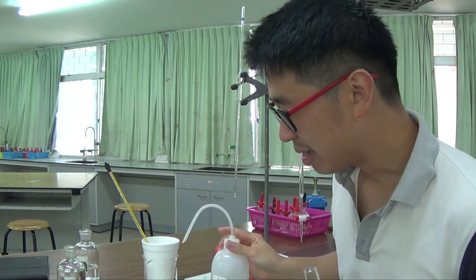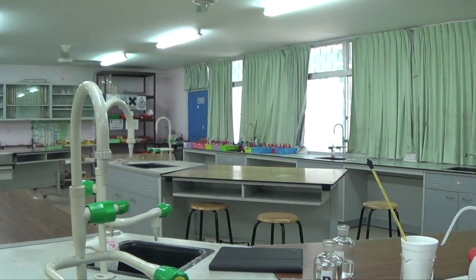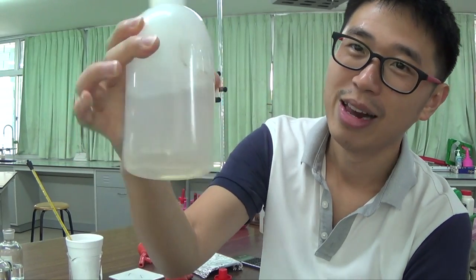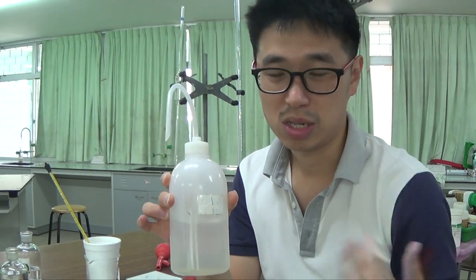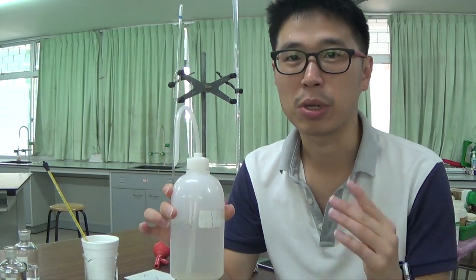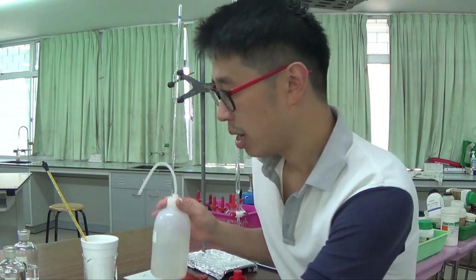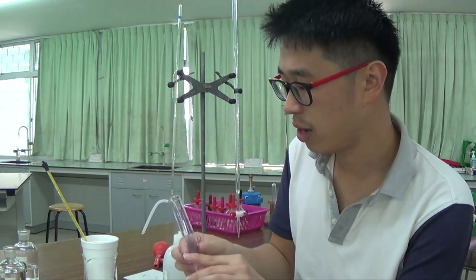They say add water, but what you never do is use tap water. What we use instead is distilled water or deionized water. Distilled or deionized water means that they are pure water, pure H2O. There are no other impurities, no other dissolved ions, meaning they cannot interfere with your results. They do not add further impurities to your experiment. So all we do in solution chemistry is use distilled or deionized water.